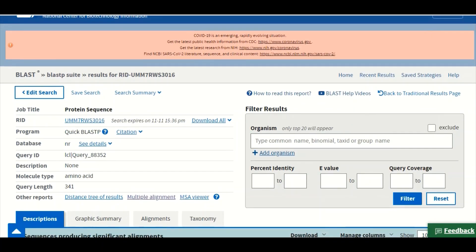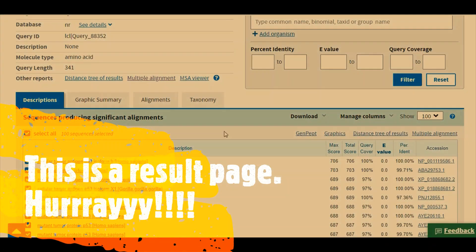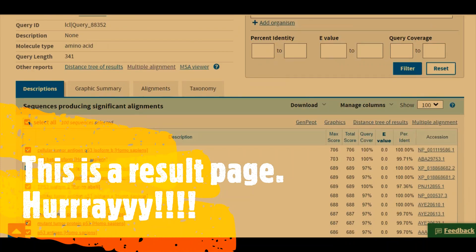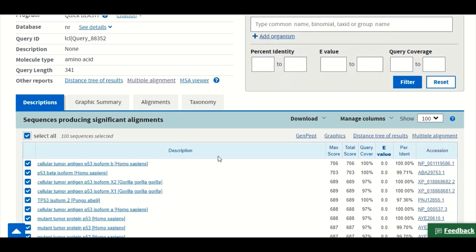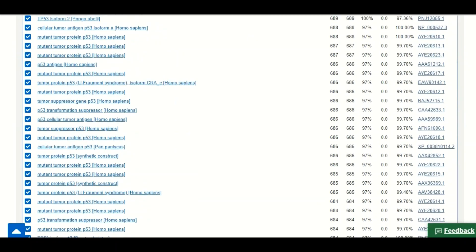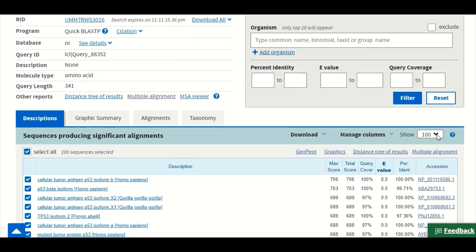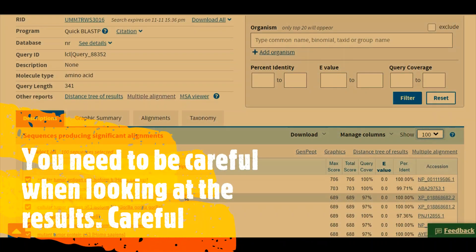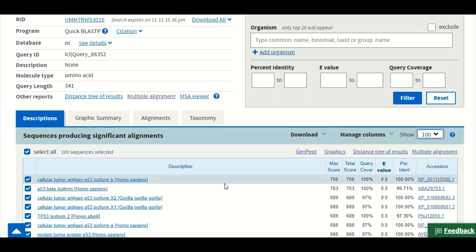When your search is complete you will have a results page where you can find the homologues of your protein sequence present in the databases. For example, cellular tumor antigen p53 isoform b is shown as a homologue of our protein sequence. The BLAST program returns 100 sequences related to our query. Keep in mind that the sensitivity and specificity of BLAST is not very high — there are always false positive results, and some true positives may be missed.